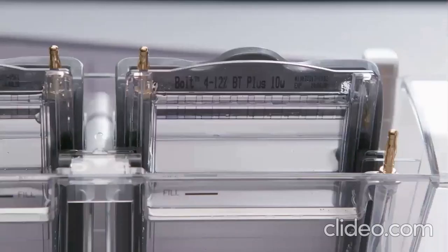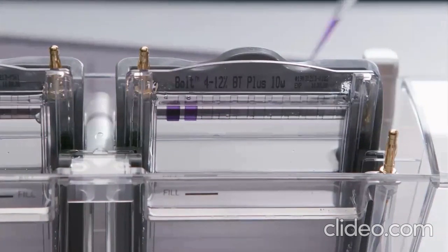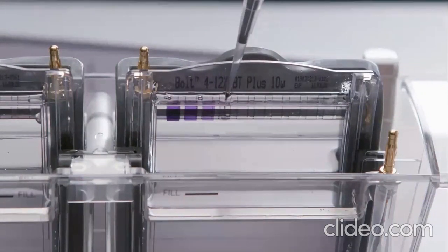Simply lower the pipette tip into the well and pipette the sample into the well. The front-loading, wedge-shaped wells make it easy to load samples using a standard pipette tip. Load the pre-stained ladder into a separate well in order to assess the relative molecular weight of the target proteins and monitor the separation during electrophoresis.